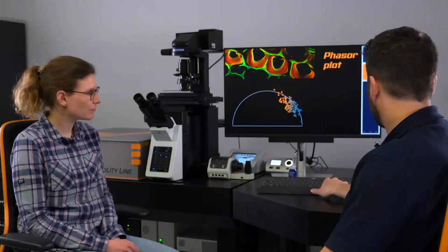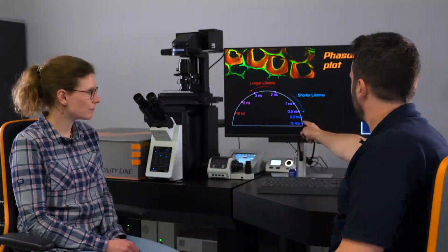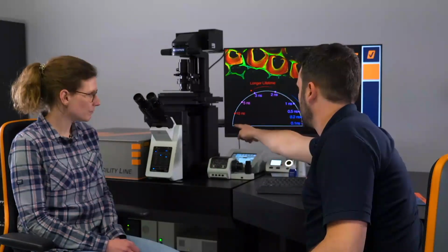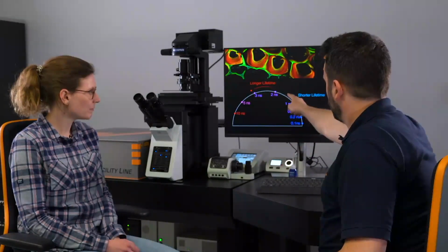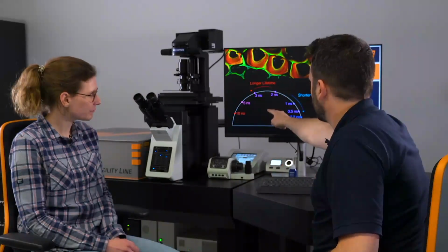Now, how can we tell what this position exactly means? If we go here and put a time scale to the semicircle, we can see that on the right we have very short lifetimes, and going along the semicircle we go to the longer lifetimes. So every dot which is right on the line here will be a pure lifetime population, while dots which are further in the center will be mixtures of different lifetimes.